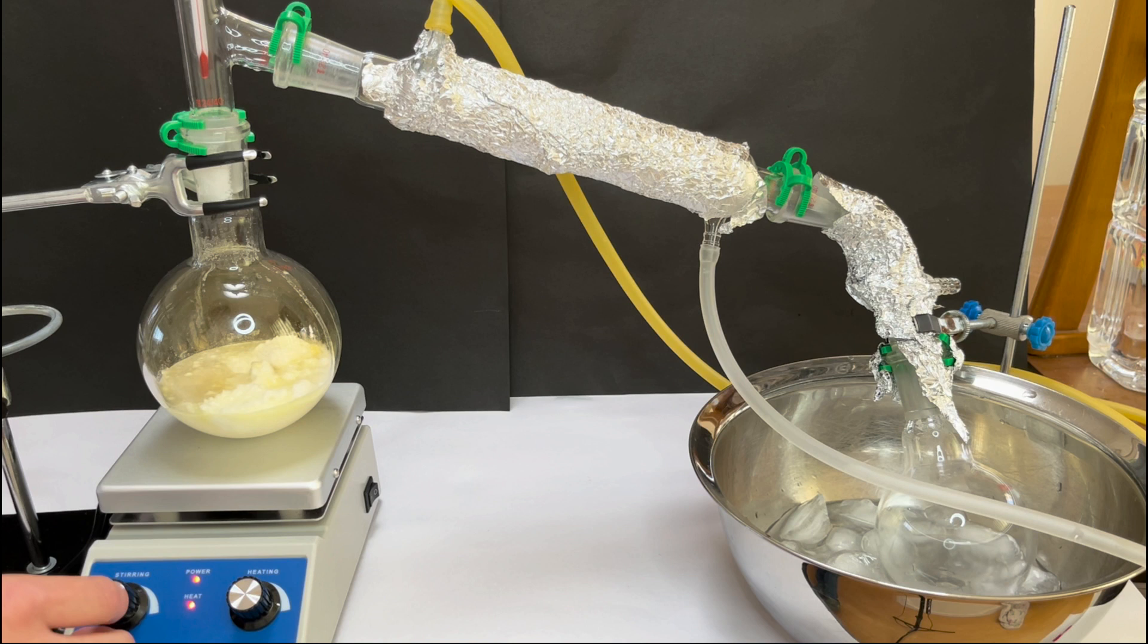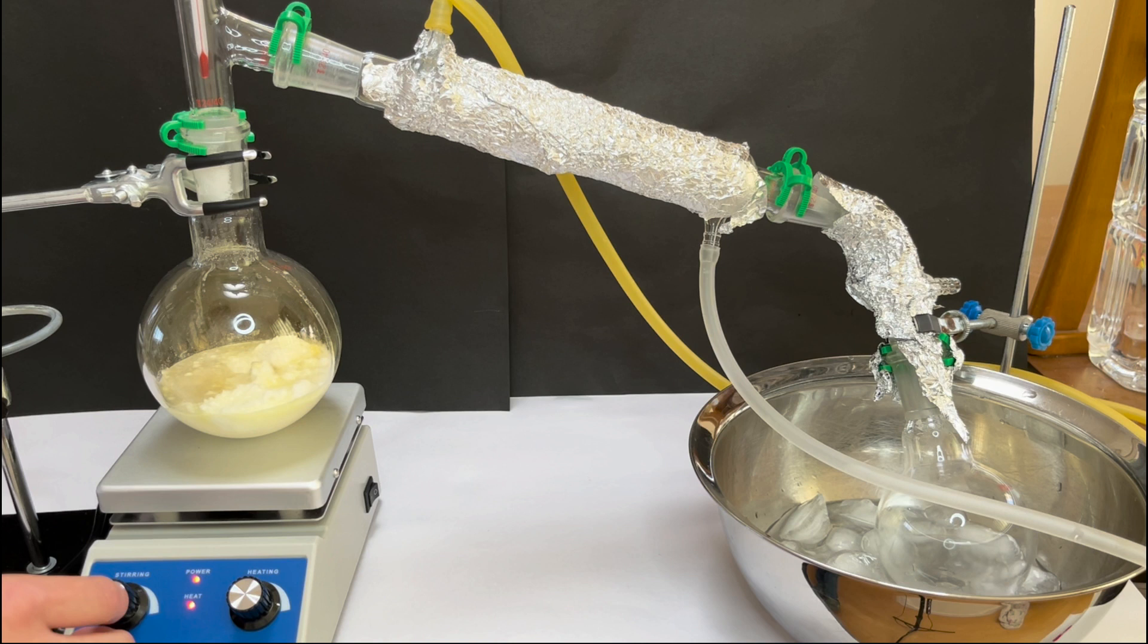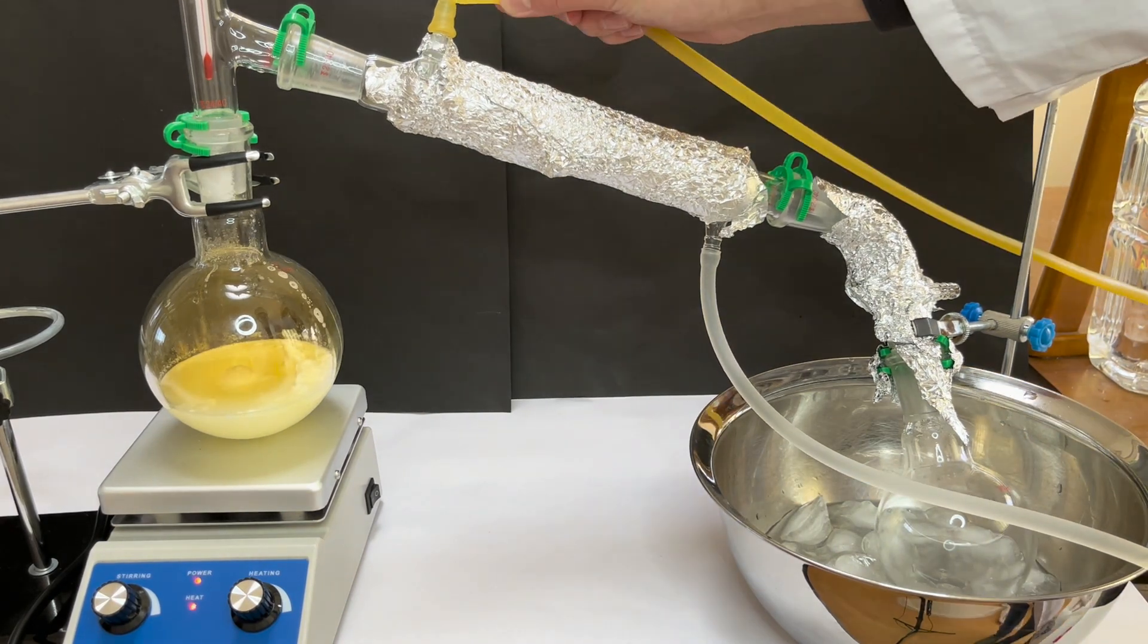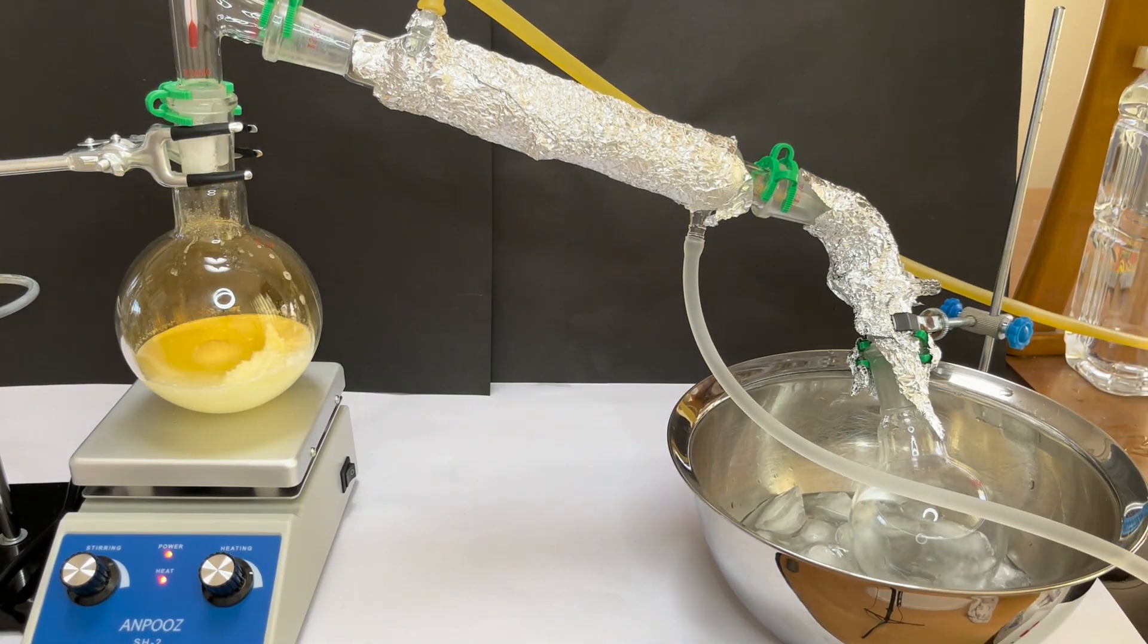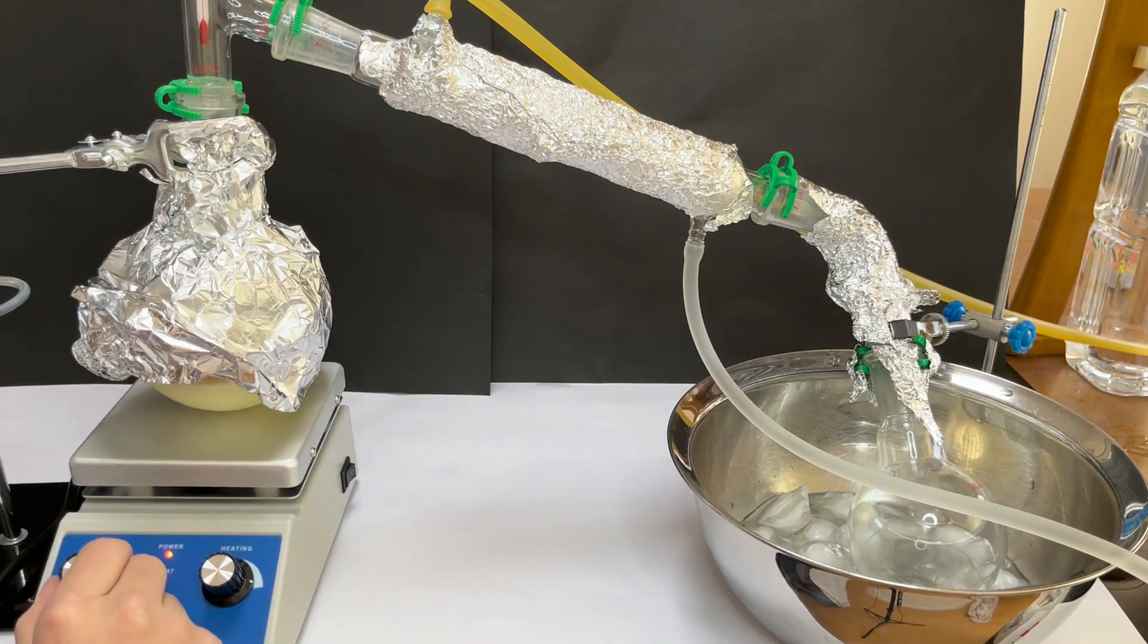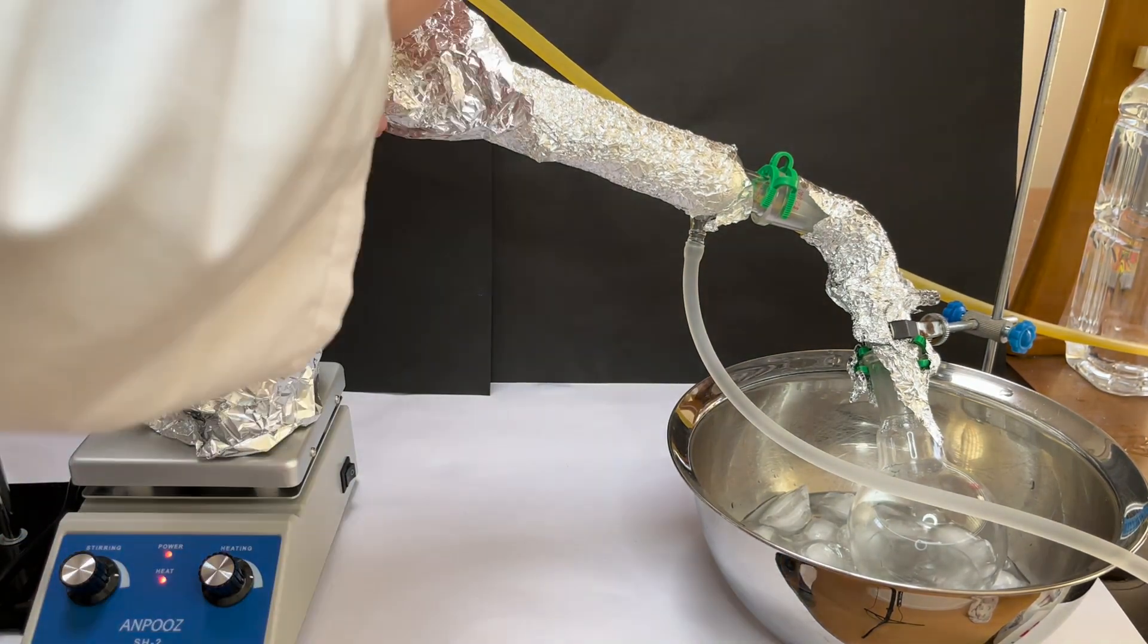When the nitric acid has evaporated, it will be condensed in the distillation cooler and it will drip into the right flask that I'm cooling with ice and water. When I put the sulfuric acid into the flask, it immediately reacts with the ammonium nitrate and releases some yellow gas, which I think is nitric acid vapor.